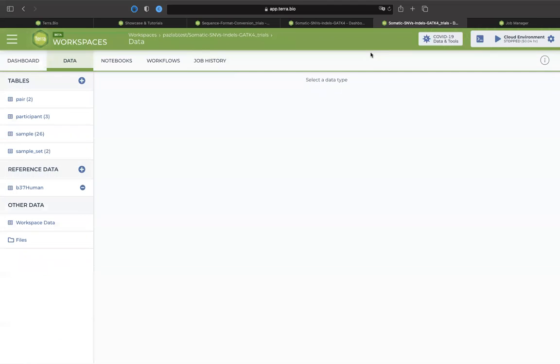And that ends it for variant calling, somatic variant calling, and viewing BAM files in IGV.